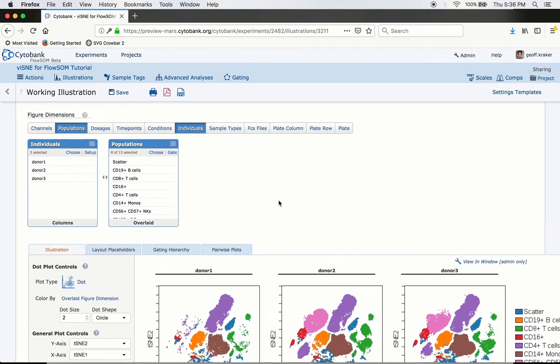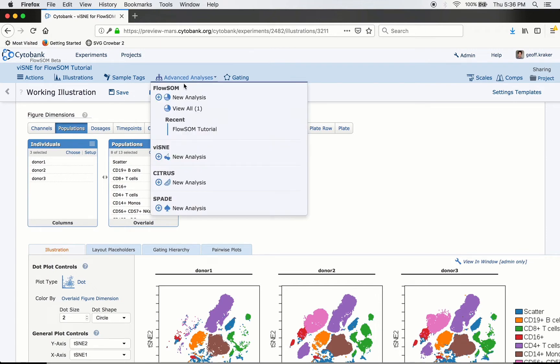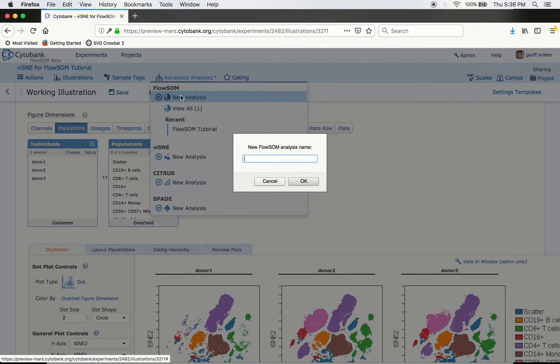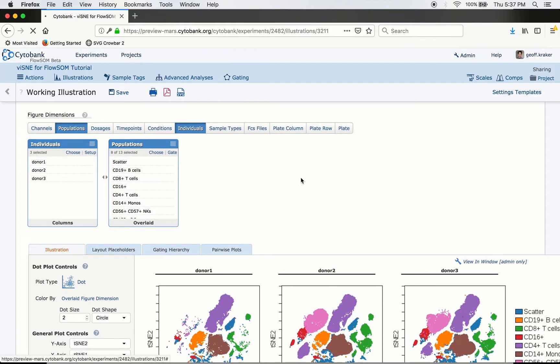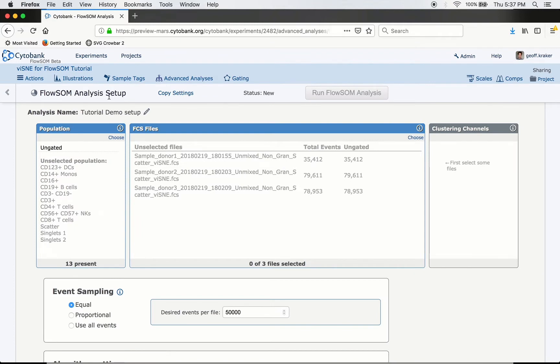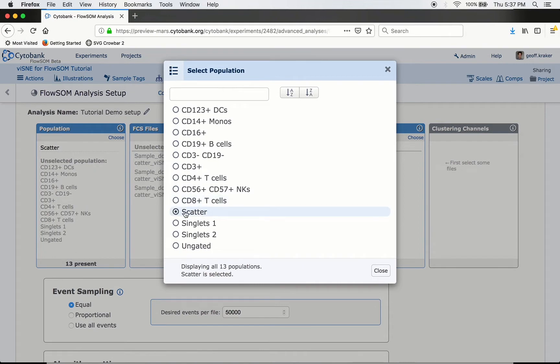The first step for the algorithm is to go to Advanced Analysis, click on FlowSOM, and click New Analysis. Give it a name, and you're greeted with the FlowSOM setup page. The first thing is to choose a starting population. I've manually gated several starting populations and final subpopulations in the VISNEE experiment. For your own data, we'd recommend starting with a relatively clean population — something like singlets, scatter, or CD45 positive. In this case, I'll start from our scatter population.